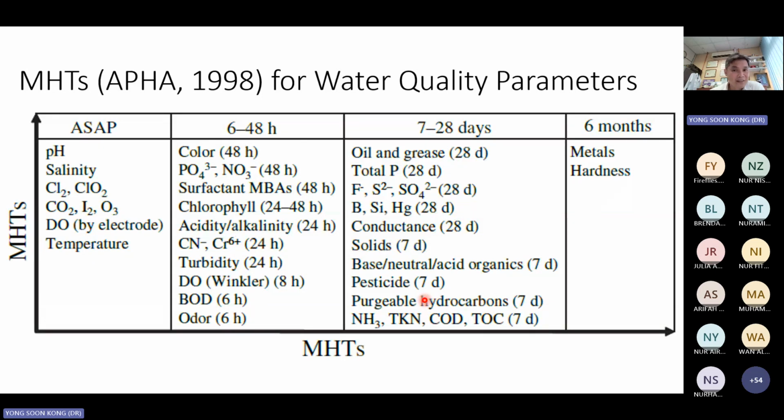Before I continue, do you realize that there are certain parameters that you need to measure immediately, some that are later? Like I told you, if we are going to analyze heavy metal, you cannot destroy it. So it is still inside your water sample no matter what. If you want to wait for 6 months, it's still going to be inside.